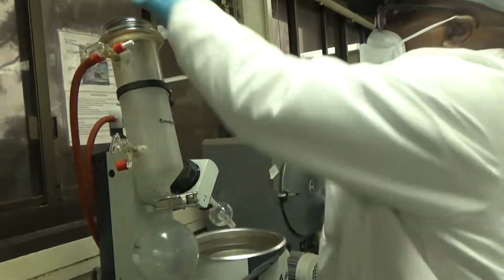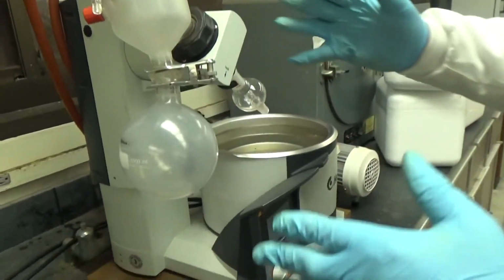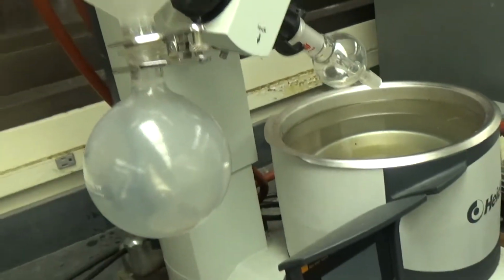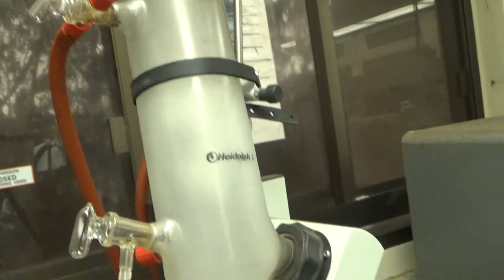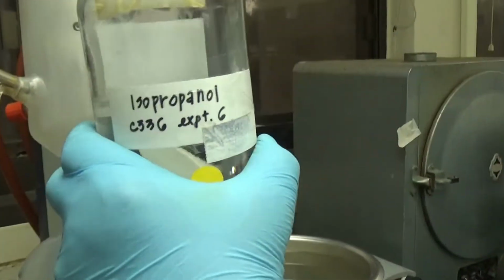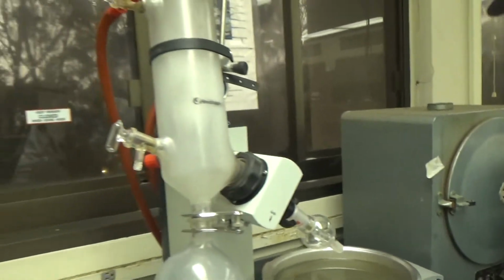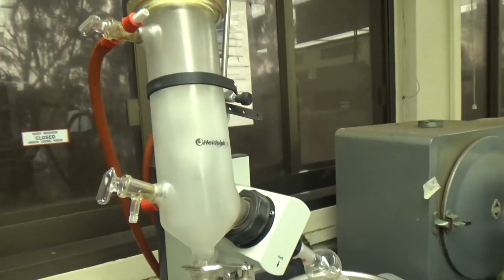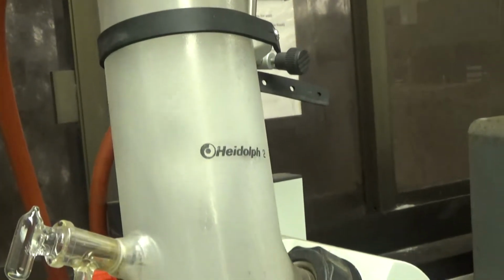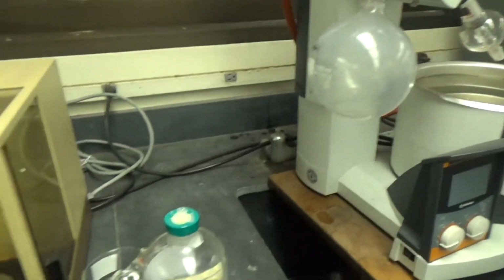That's dry ice, so you're adding dry ice. This is the rotary evaporator. It's just got a water bath, a flask, and a condenser. That's isopropyl alcohol, also called 2-propanol or isopropanol. You added the dry ice, and that will cool down the internal surface. And you have a vacuum pump.